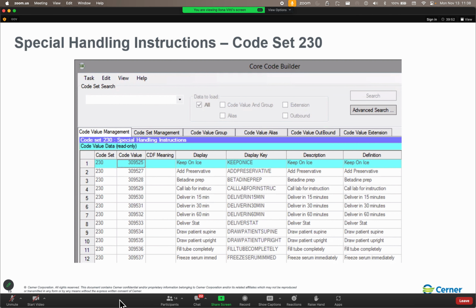Okay. Technically not a troubleshooting opportunity. It just means that the model experience domain that my train domain is copied from must have changed something on their side. So, Jerry, go ahead and work with this one this week. That way you've got the chemistry manual bench on there. And I'm going to update my specimen management PDFs to include that. Okay, so back to my vitamin D25.